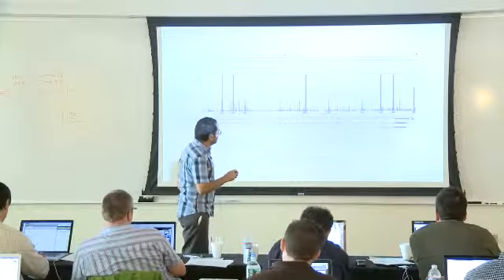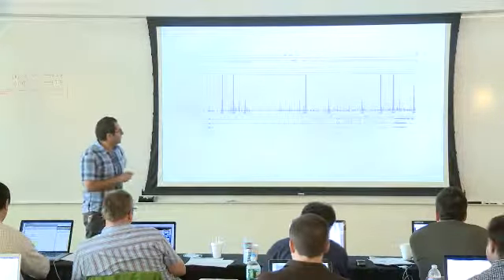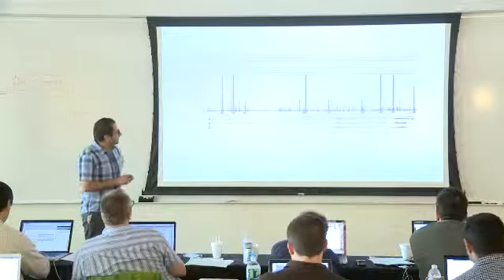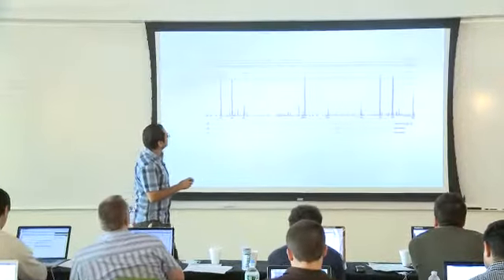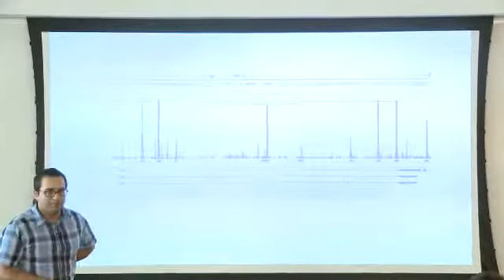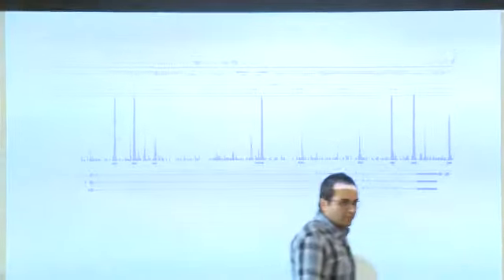Is that, okay, you can look at ChIP sequencing data on IGV. And if you look here, this is approximately 90 kb, but the genome is much, much larger. And even when we look at it and we see peaks and we get ideas, sometimes we want to compare two data sets, or we want to compare more than two data sets.